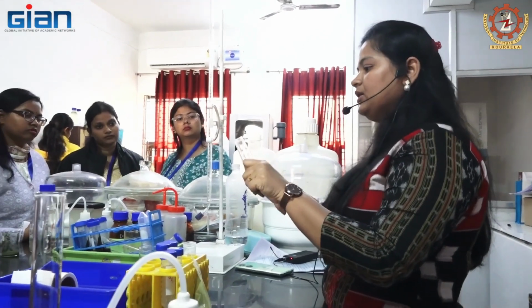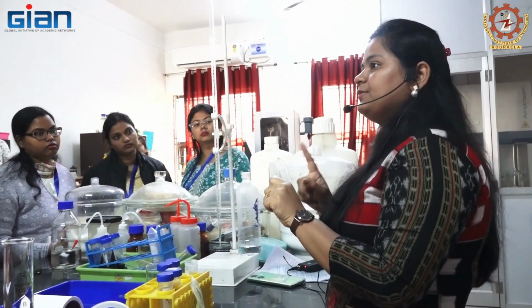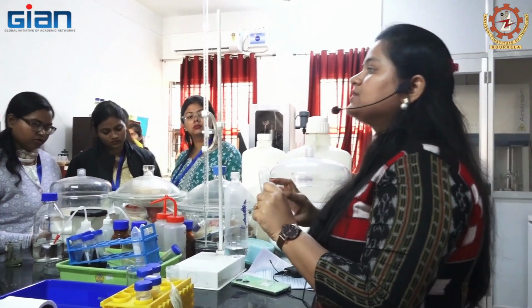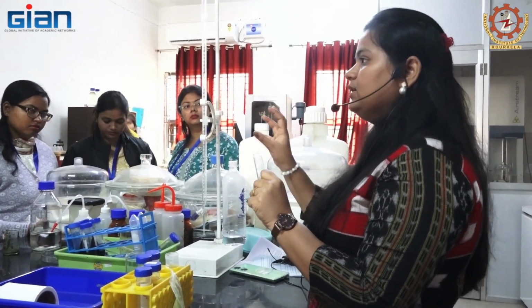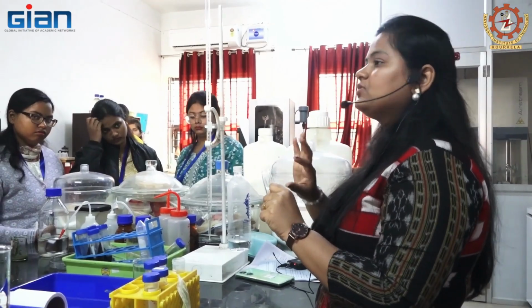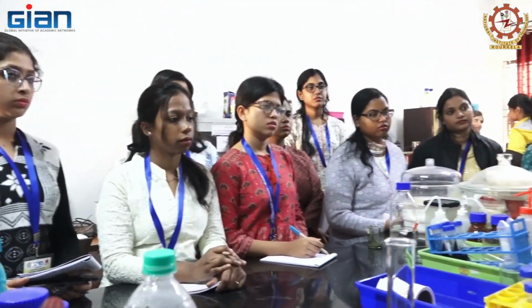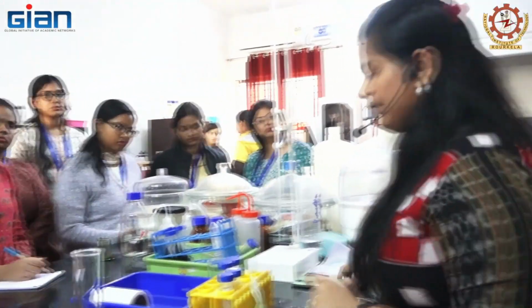Imagine this is the cell wall. The high temperature breaks the cell wall, and the target compound present in it is dissolved by the solvent. Then, through the penetration of the solvent, all the solubilization happens, and all the target compound is released. Got it? Then we'll go and see how the extraction happens.